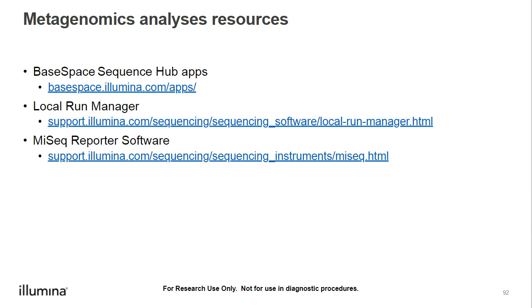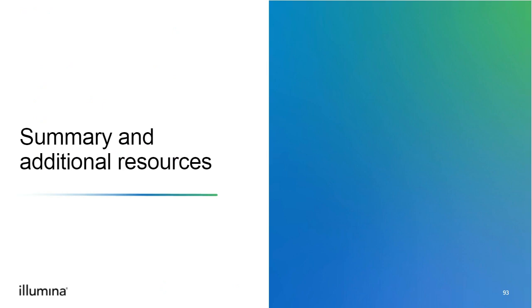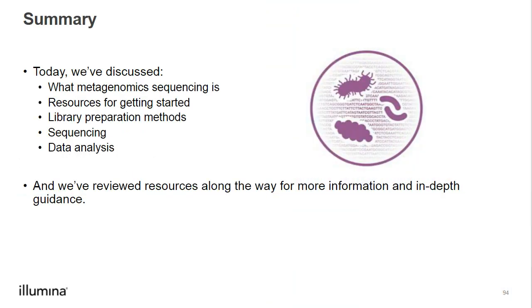Let's summarize our discussion today, and I'll include some additional resources to help with your metagenomic sequencing project. Today, we've discussed what metagenomic sequencing is, resources for getting started, library preparation methods, sequencing for metagenomics libraries, and briefly touched on data analysis. We've reviewed resources along the way for more information and in-depth guidance.